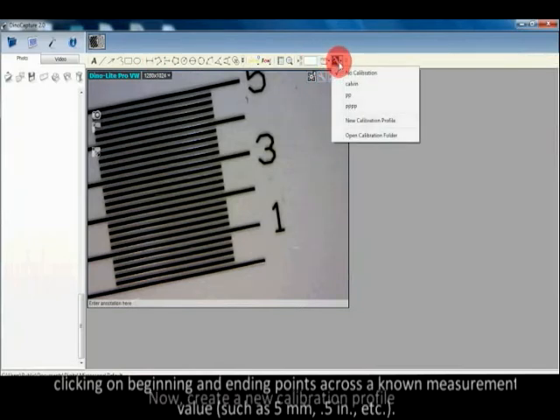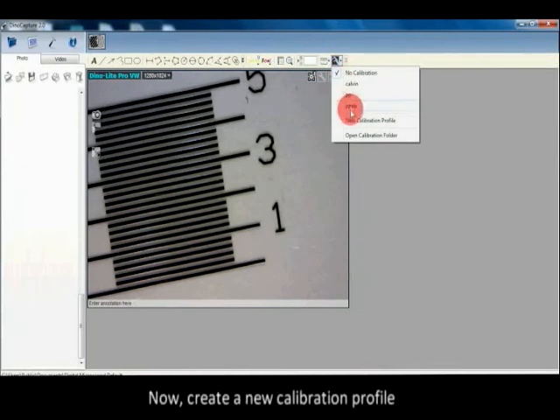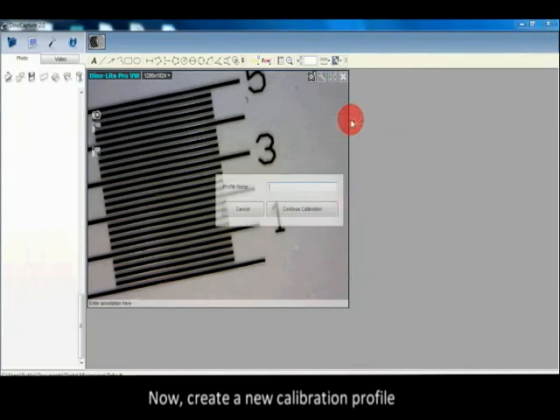0.5 inches, or other measurements. Now create a new calibration profile.